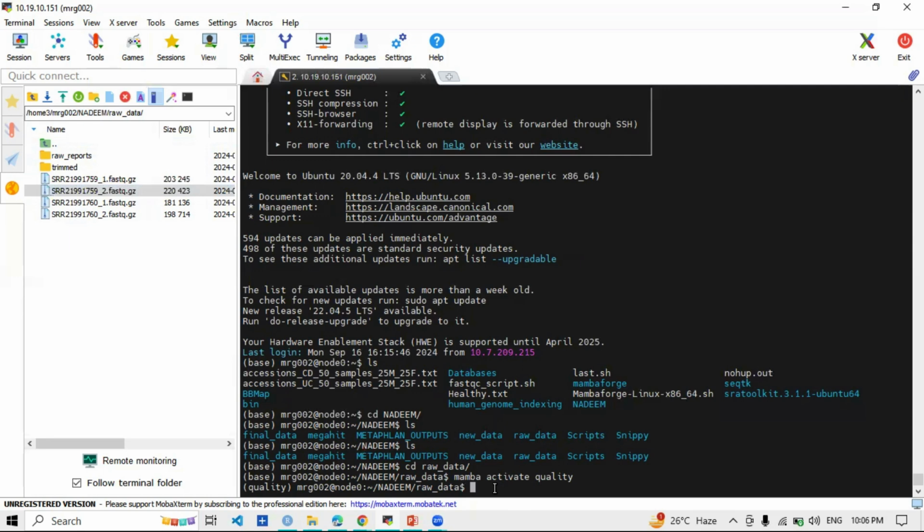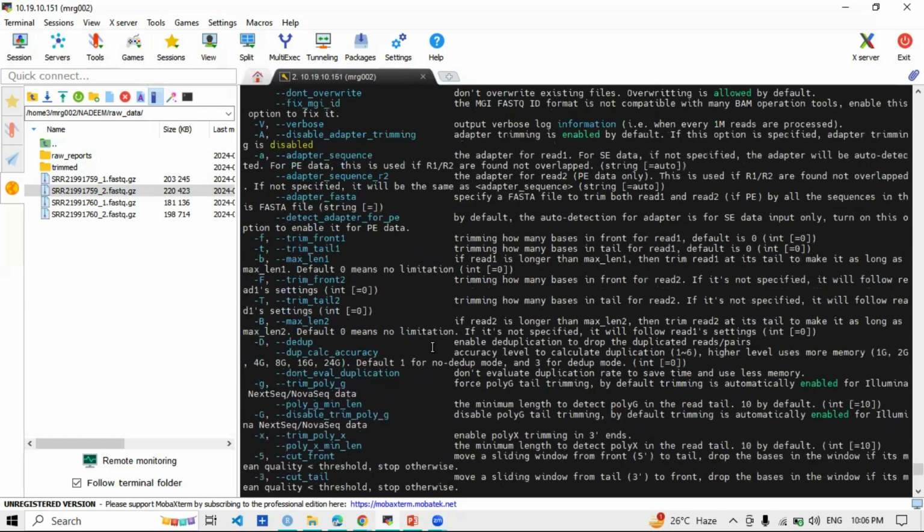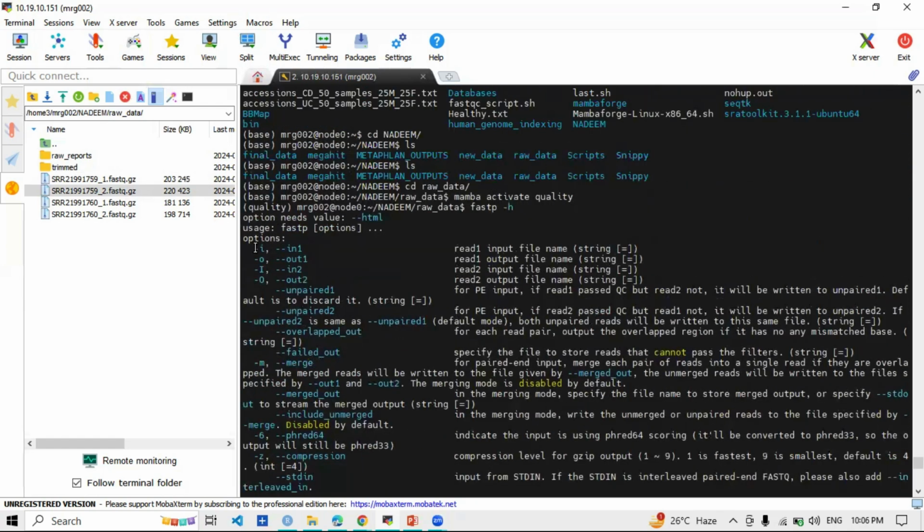and now I have decided to add some flags and pre-process it. Before pre-processing it, I want to show you something very important. Fastp is a tool, and if you want to understand the flags inside this tool, this is the help of Fastp. If you want to input your sample, you type -i, and this is read one. If there is another read, like in my case, you write the input as capital -I. So for input it is -i, and for output it is -o. These are the flags used to input your files and obtain your outputs. So this is simple.